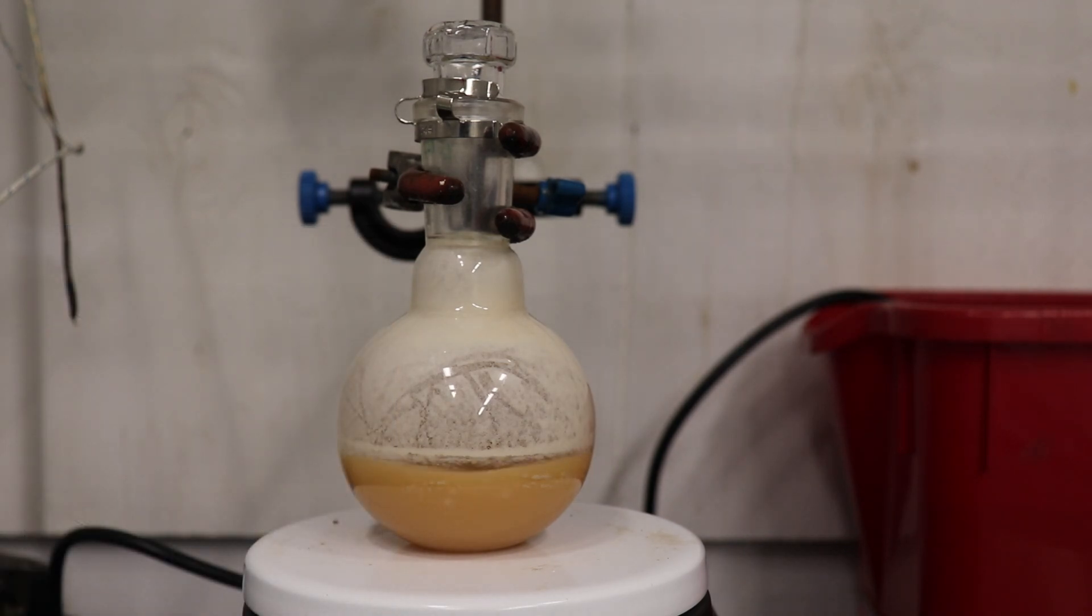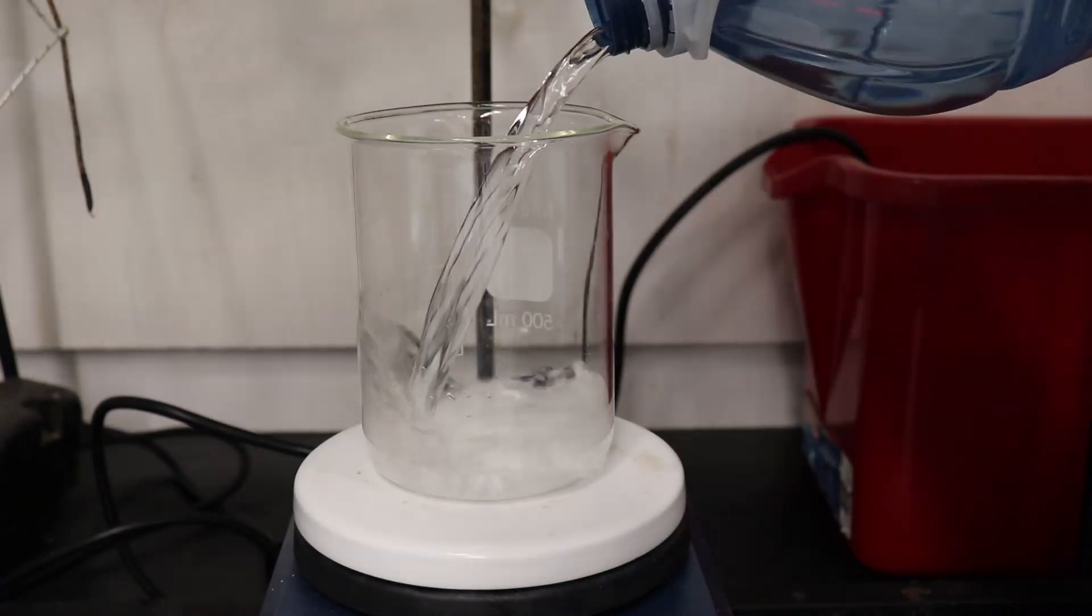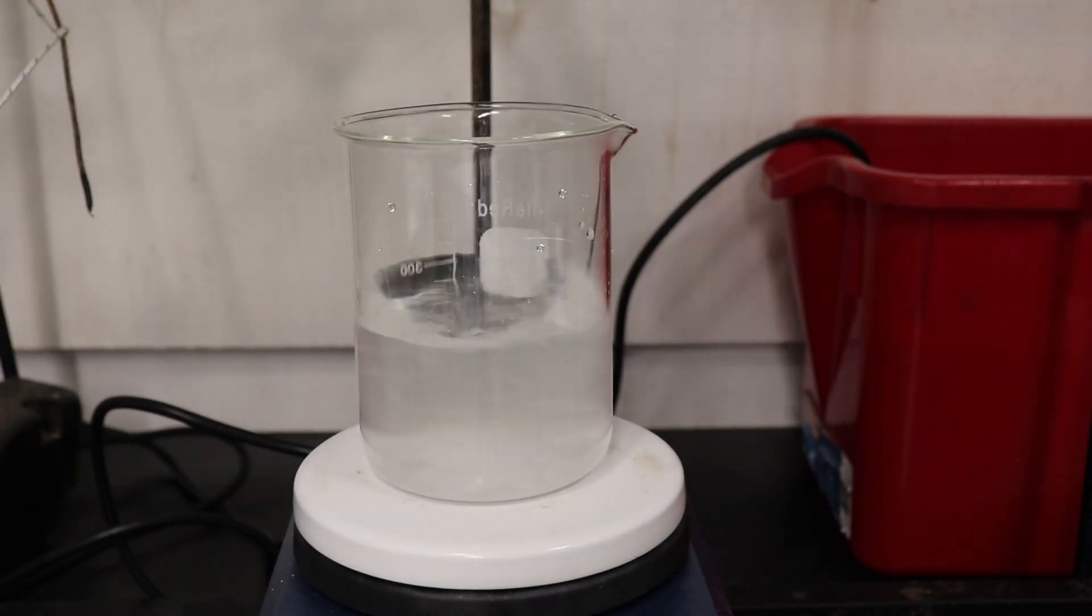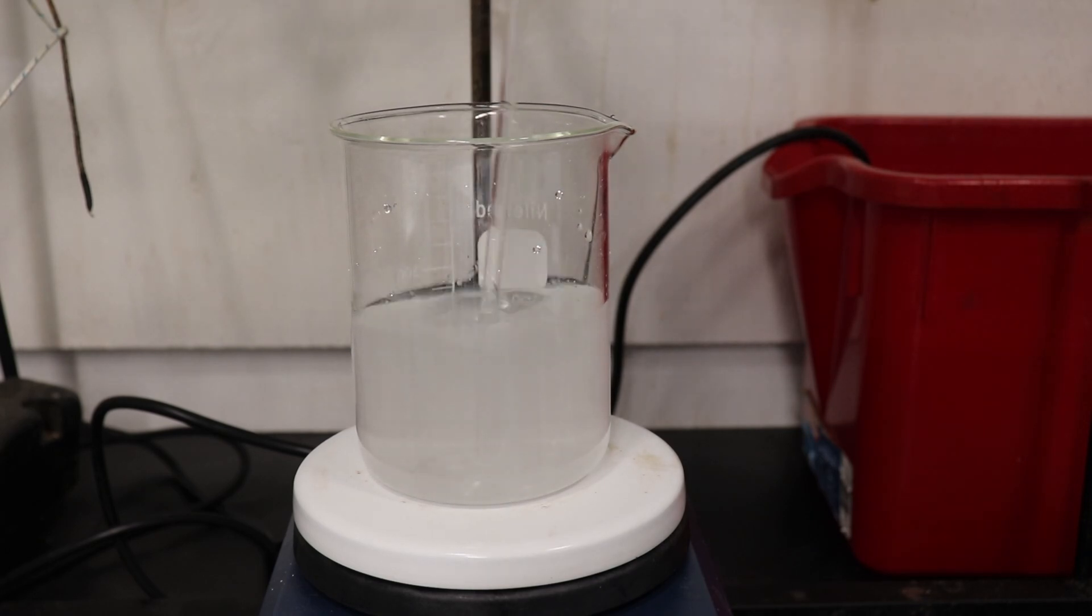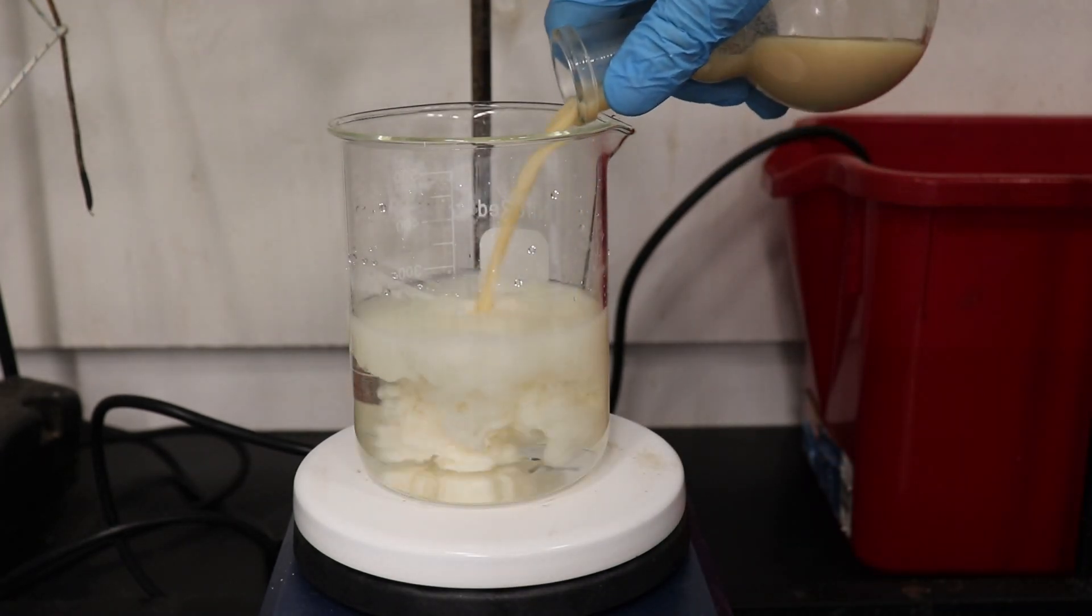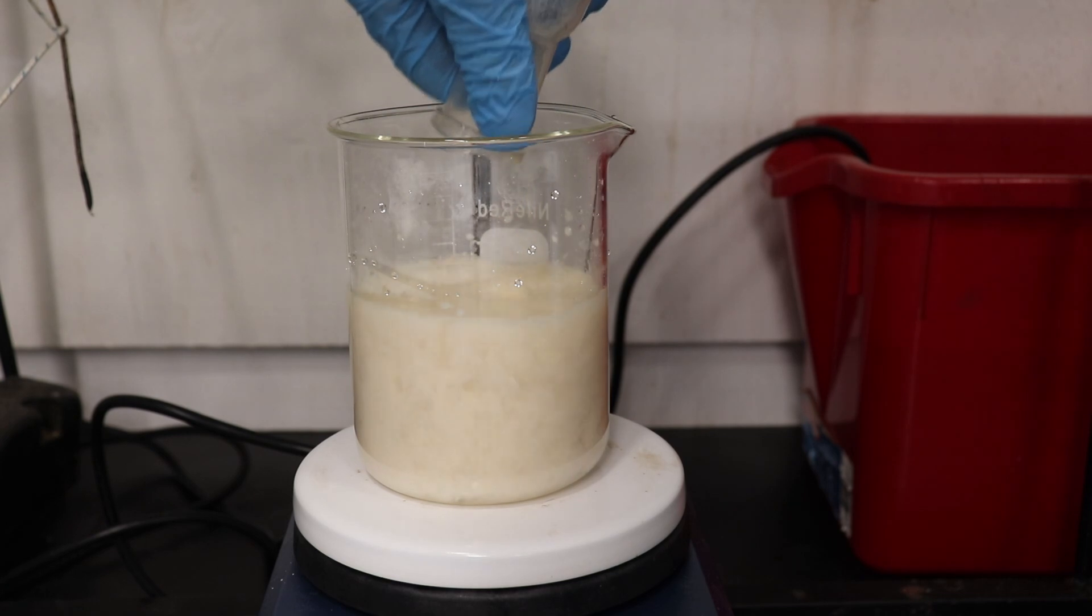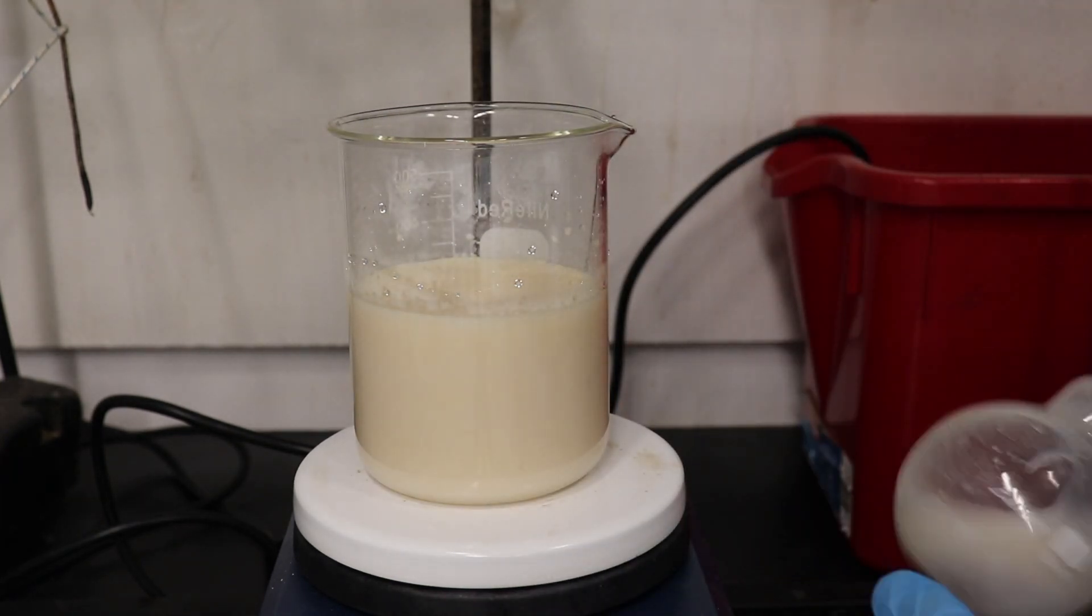After the 72 hours had elapsed, a precipitate of 2-methoxynaphthalene is seen in the flask. 250 milliliters of a 5% solution of sodium hydroxide is prepared. Then, the contents of the flask are poured into the sodium hydroxide solution and stirred for 1 hour, which serves to remove any unreacted 2-napthol.